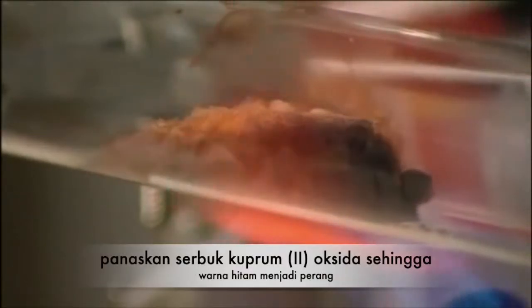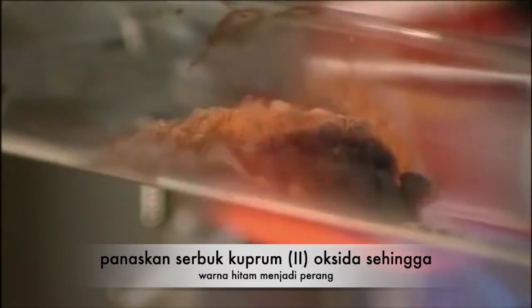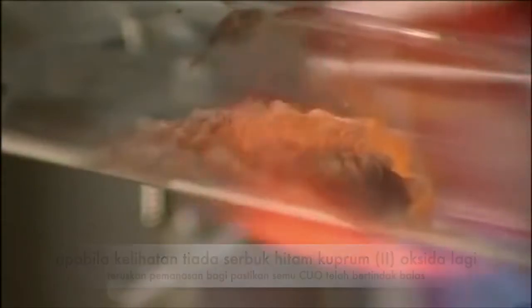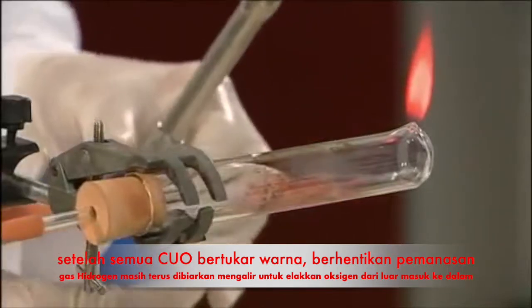Use the Bunsen burner to chase the glow along the length of the oxide until all the black copper oxide has been changed to pinkish copper. This will take up to a minute. When no trace of black remains, continue to heat for at least a further minute to ensure that all the oxide on the inside of the heap has reacted. If in any doubt, continue heating for longer. Once the flame has returned to its original height, you can stop heating.